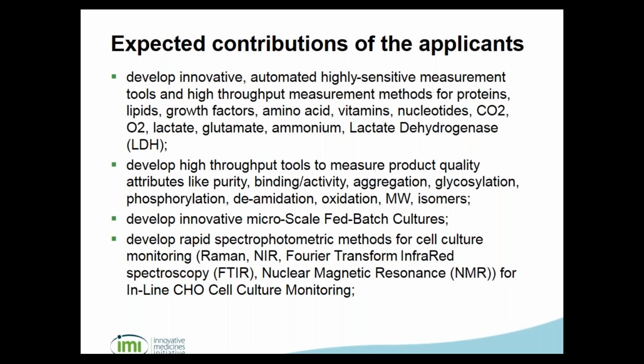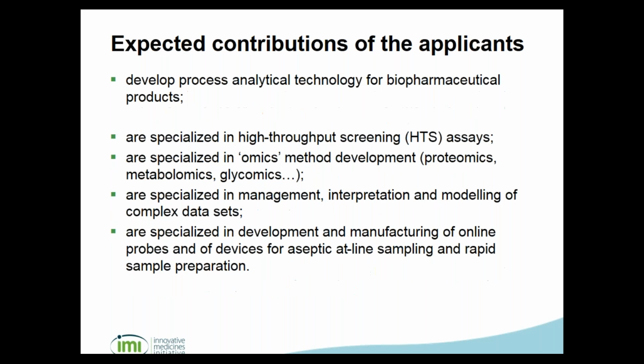Development of rapid spectrophotometric methods for cell culture monitoring like Raman, near-infrared, FTIR, whatever. Maybe there are new technologies out there, and that is of great interest, because we are really looking for innovative tools that we don't have on hand at this moment. Next slide, please.